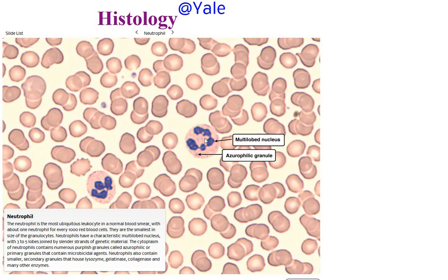So we've got this new term here, multi-lobed. Sometimes you'll see multinucleate, binucleate, multi-lobed to indicate each of these little blobs or lobes is part of one nucleus. So in the case of the neutrophil, we're dealing with a 3 to 5 lobed nucleus. And they do kind of look like beads along a string. So in this case, we've got 1, 2, 3, 4, 5 lobes of one nucleus.